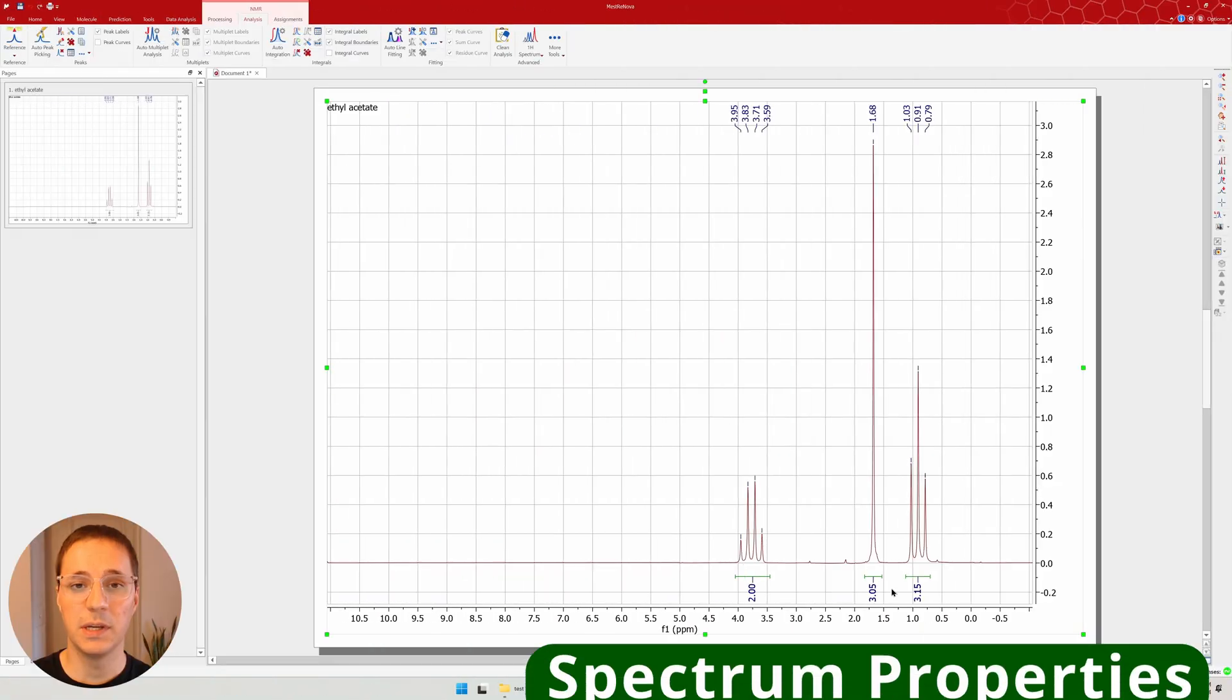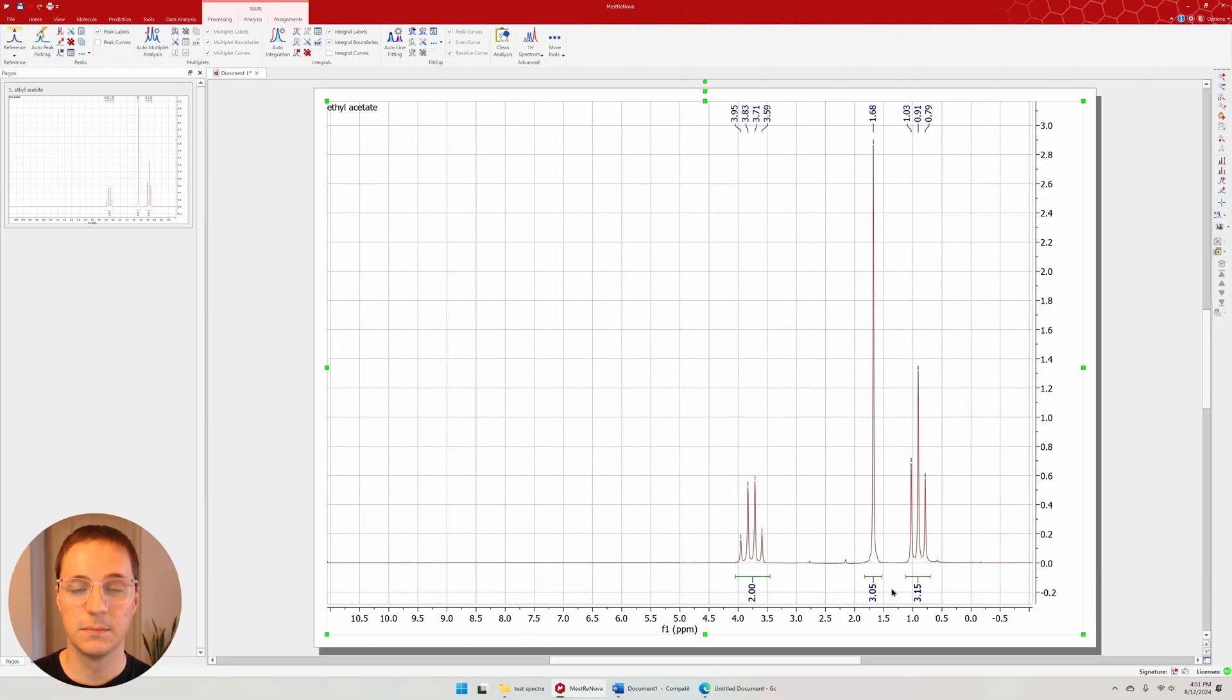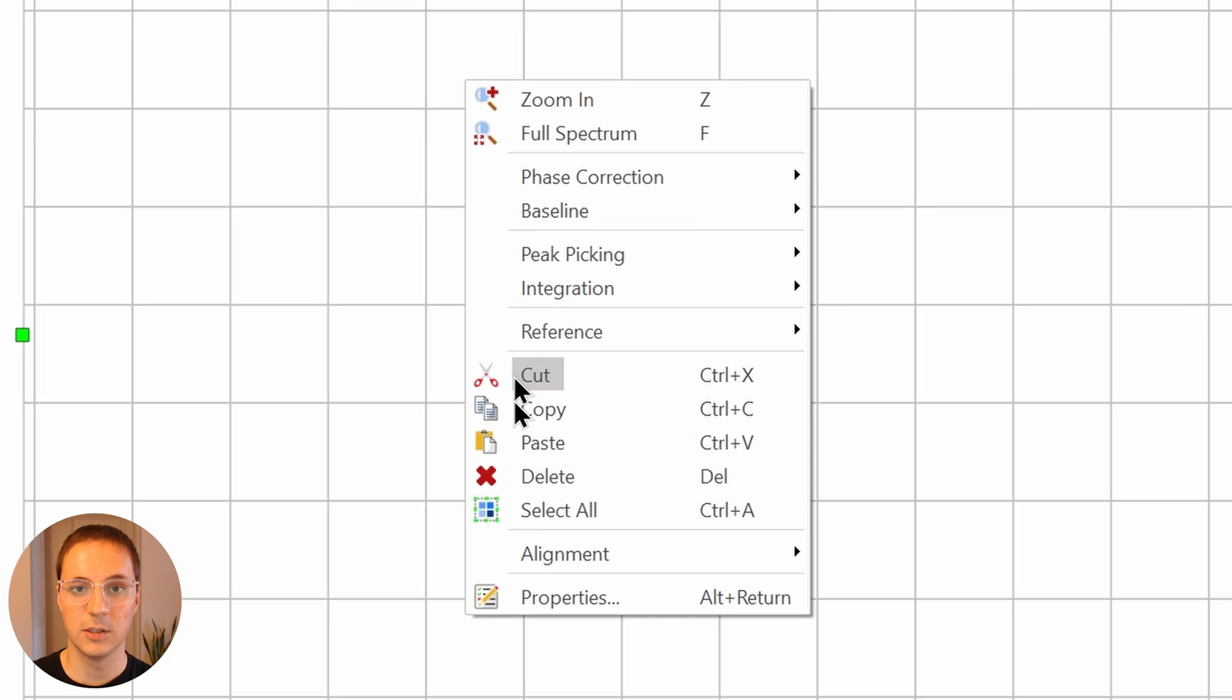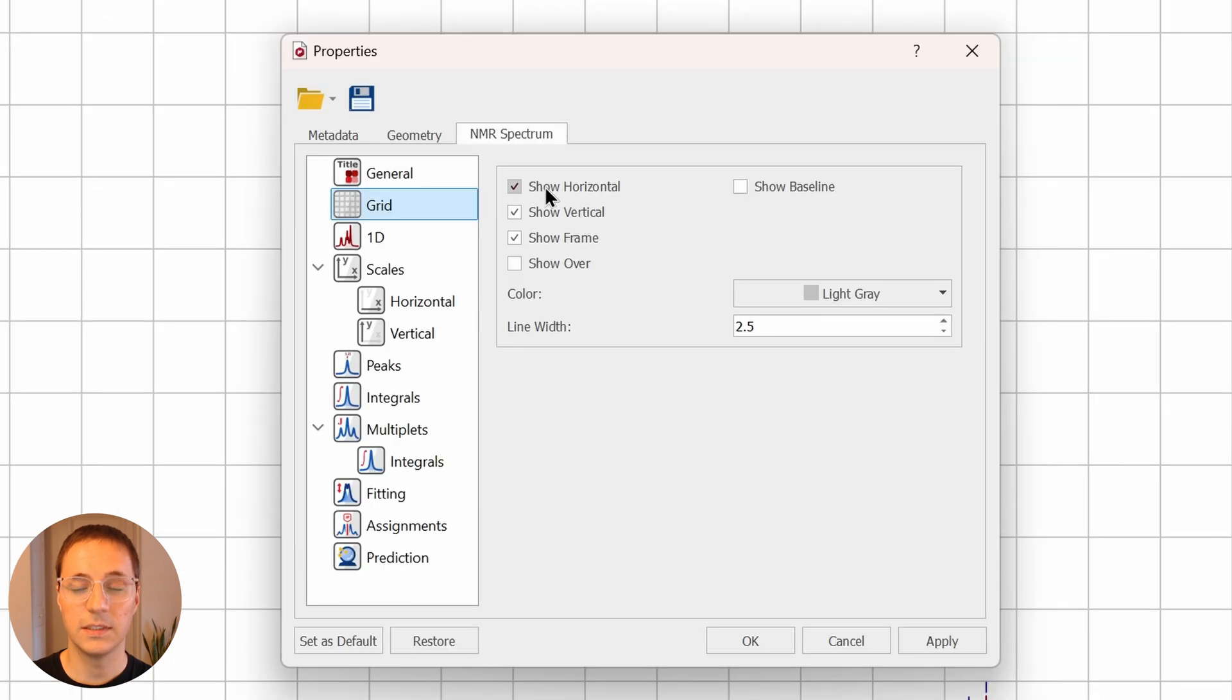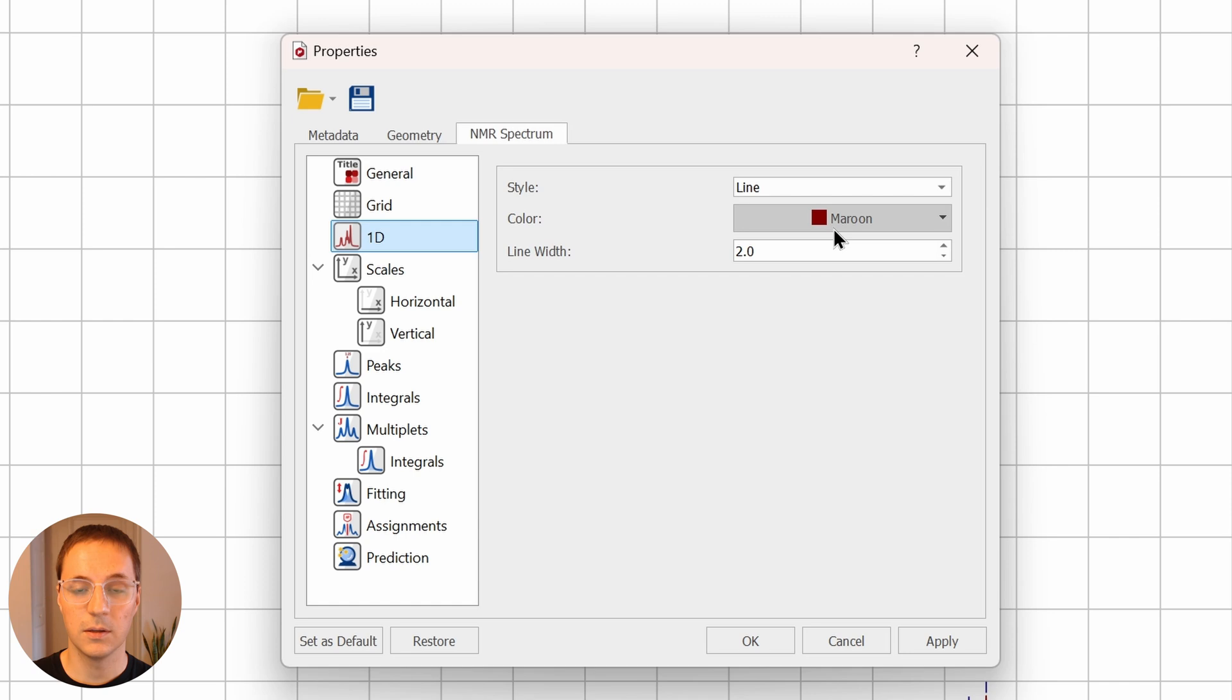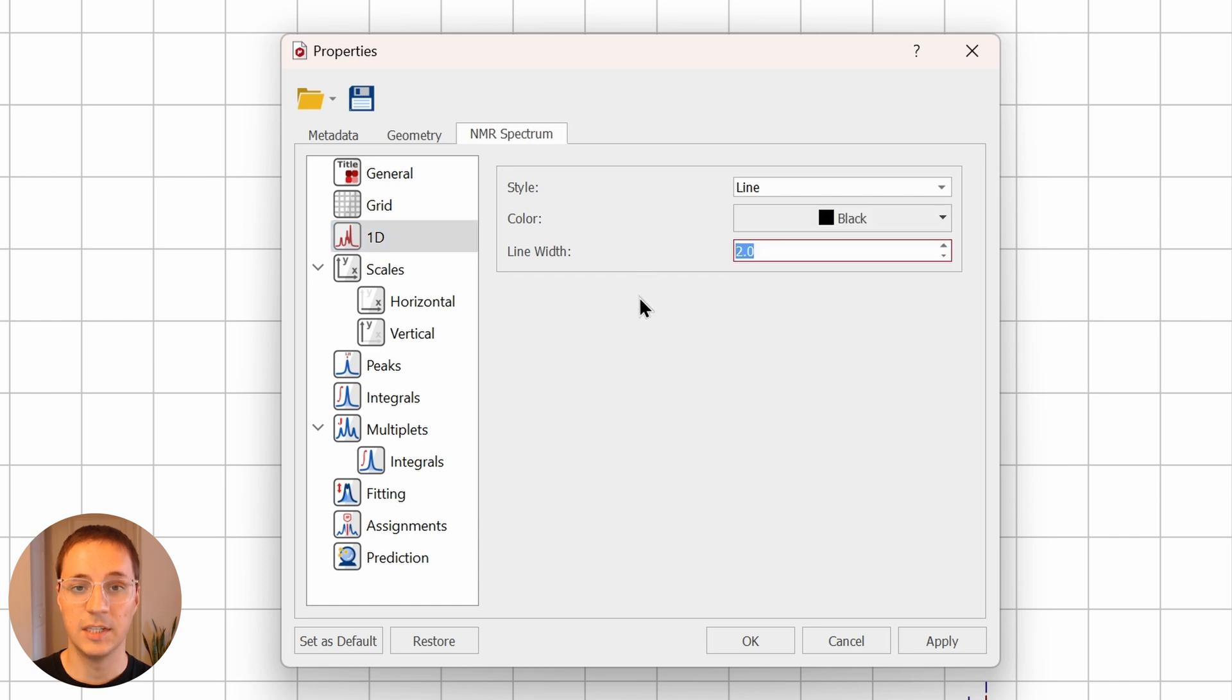At this point, we can make the spectrum look a little nicer. Right click anywhere on the spectrum and select properties. I like to remove the grid and frame, change the color of the spectrum to black, and change the line width to 4.